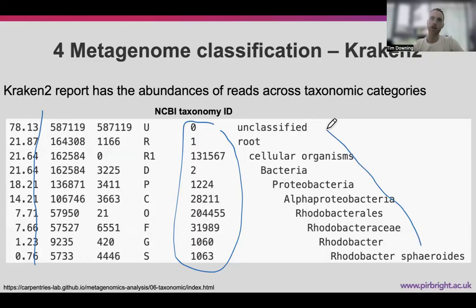So many organisms will be represented in these kinds of tables, but at low levels. If you have something with fewer than 100 reads, it's possibly a contaminant that accidentally happened during the sample prep or sequencing. It's unlikely that it is something that is reproducible.